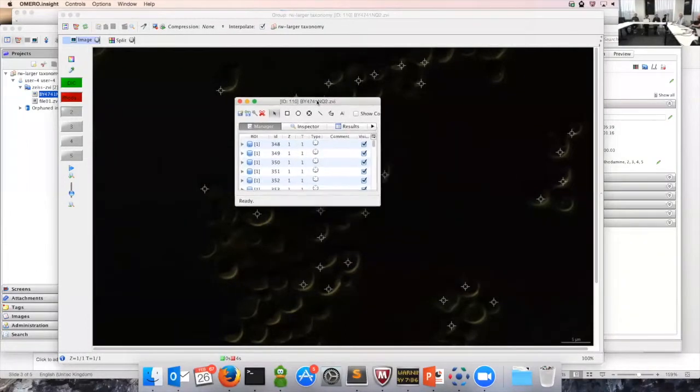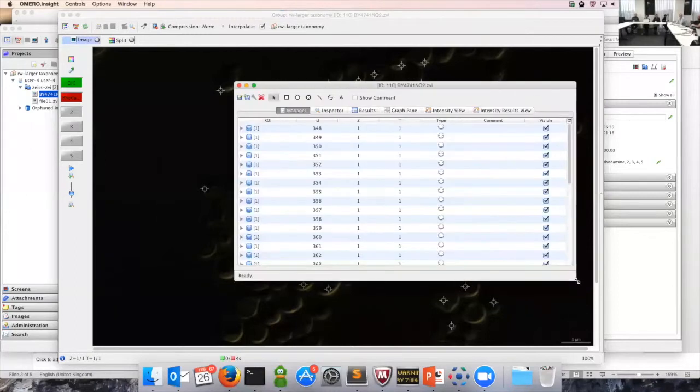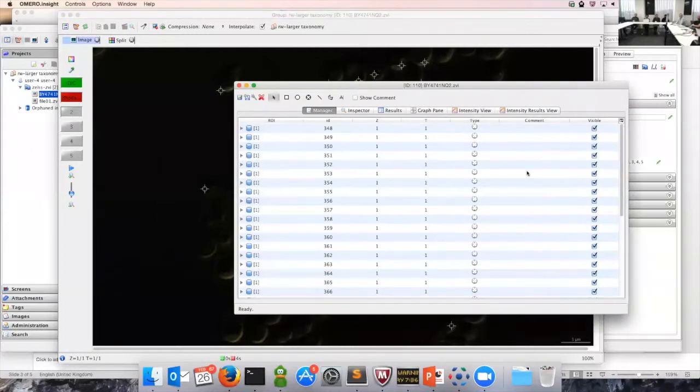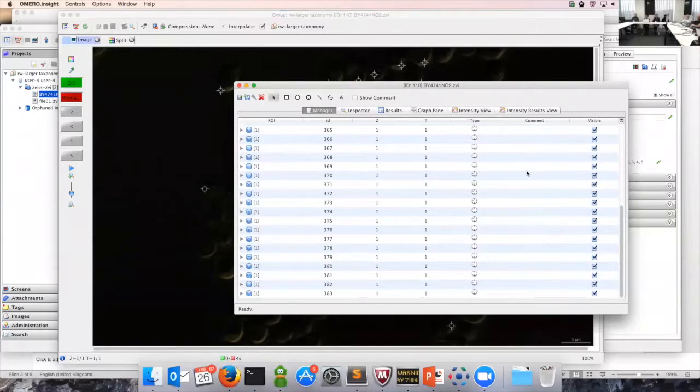I basically put a cross on each cell. Of course, these are very artificial workflows, and thus I created plenty of regions. Now I can imagine that the scientist would like to sort those regions into a fairly complex ontology, which is actually not up to him. So he has to take the ontology from somewhere.